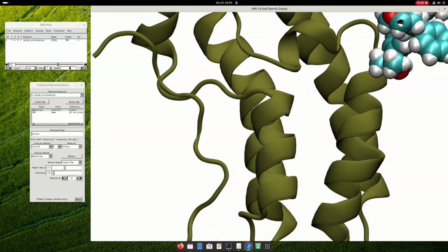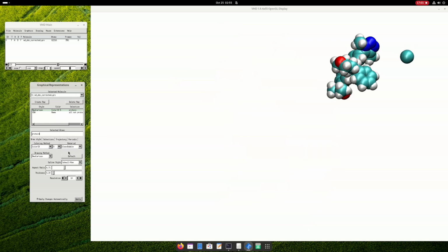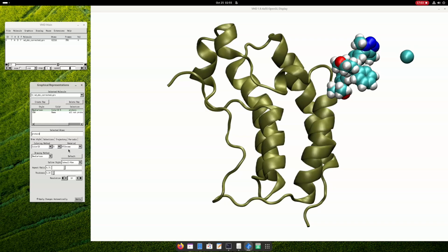You see, this is non-shiny, and this looks better from my perspective, at least. We can also go to AOShiny, AOChalky, or Edgy. I think it's better you just try out some of these on your own, and whatever you like at the end would be a better option, I would say.